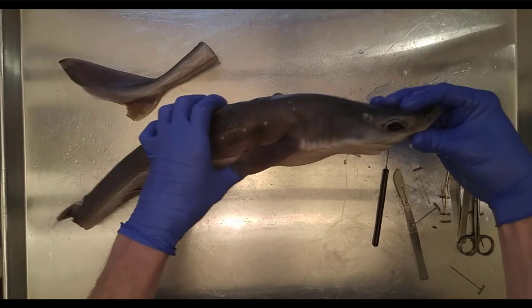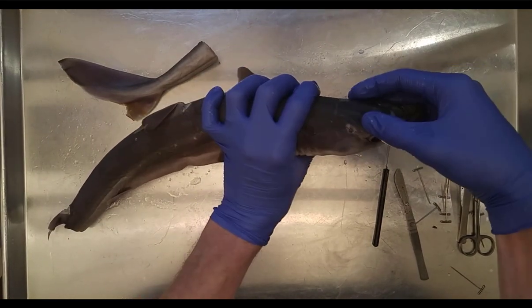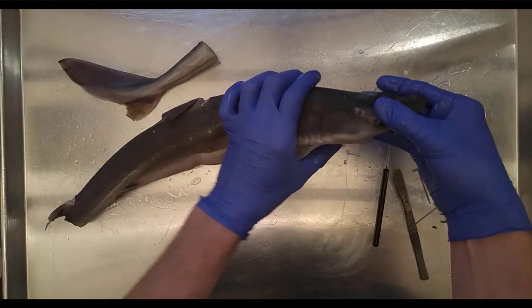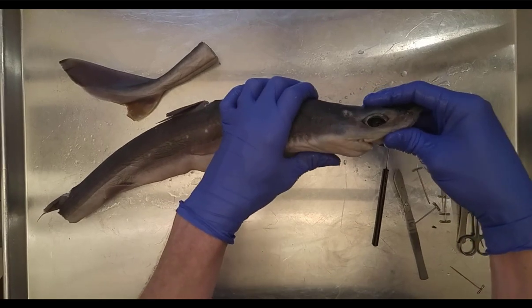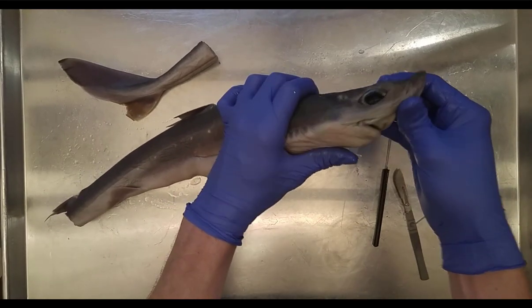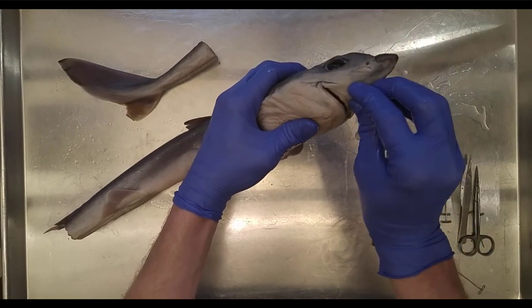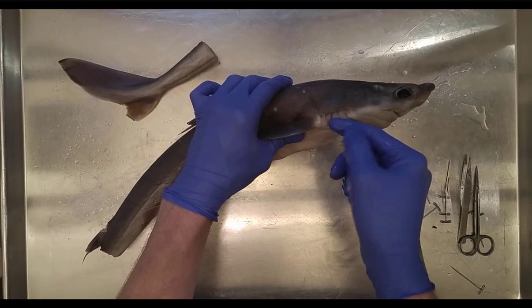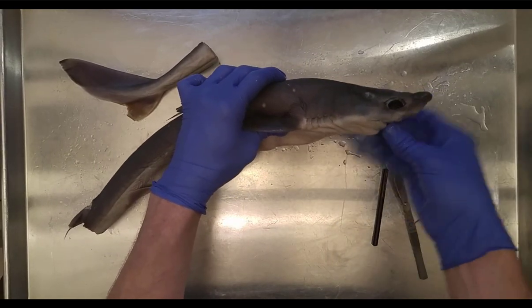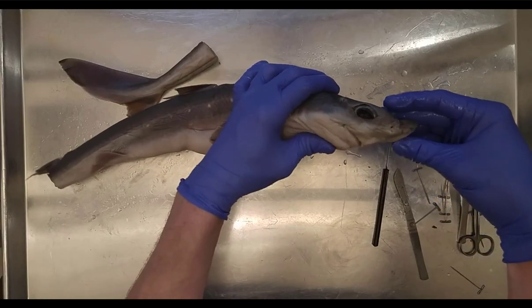Looking at the head, we have the eye and right here is the spiracle. The spiracle brings in water and oxygen to the shark when its mouth is full. Typically water flows through the spiracle and then out through the gills, but when the shark's mouth is full of food, the spiracle takes over that very important respiratory function.